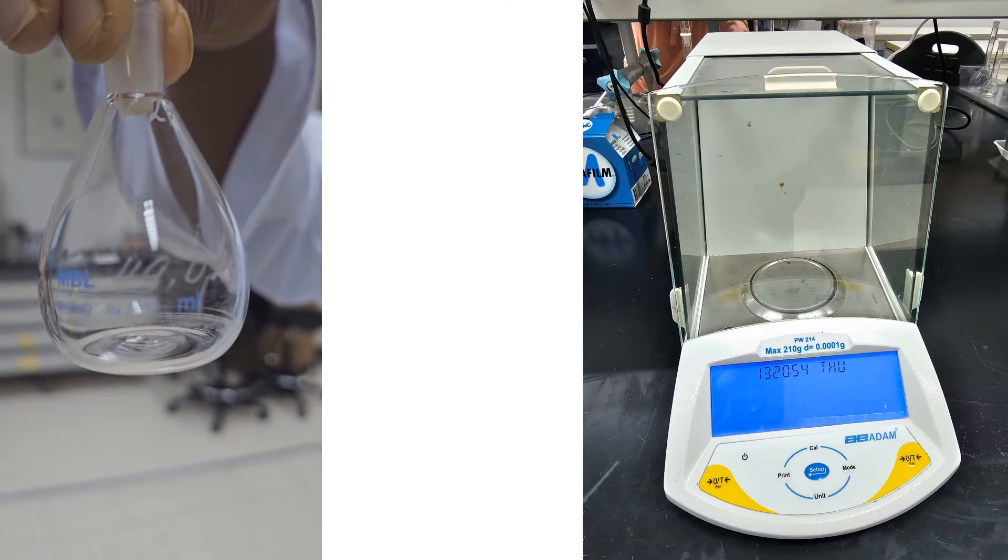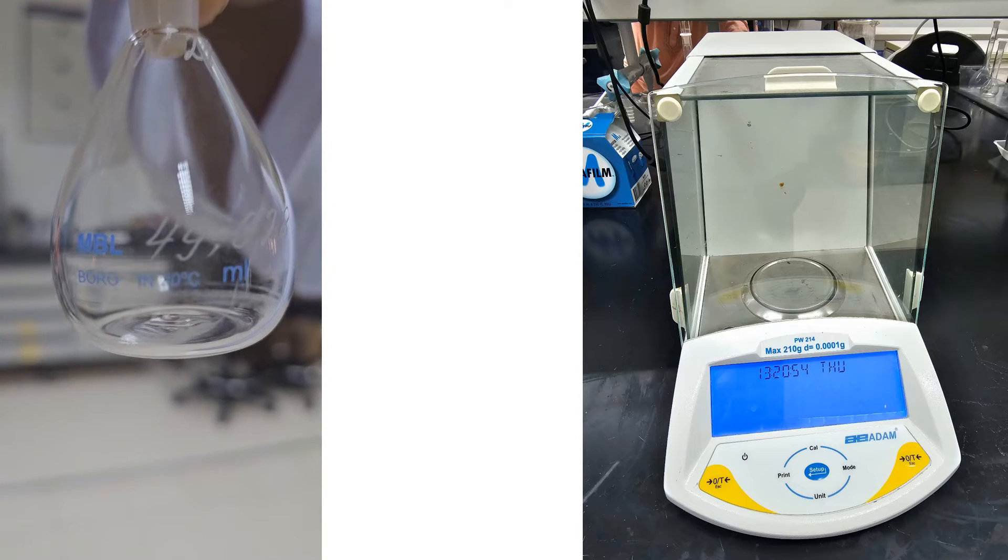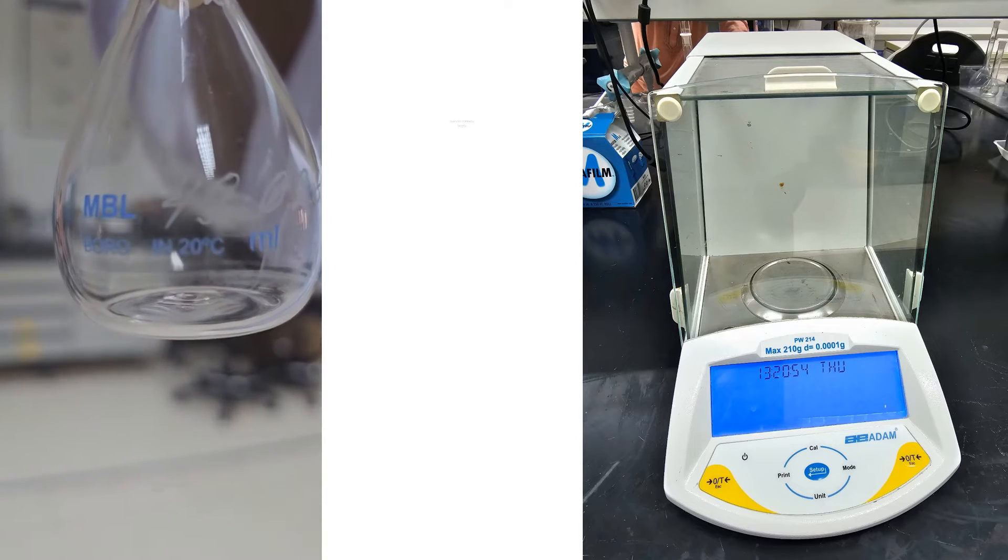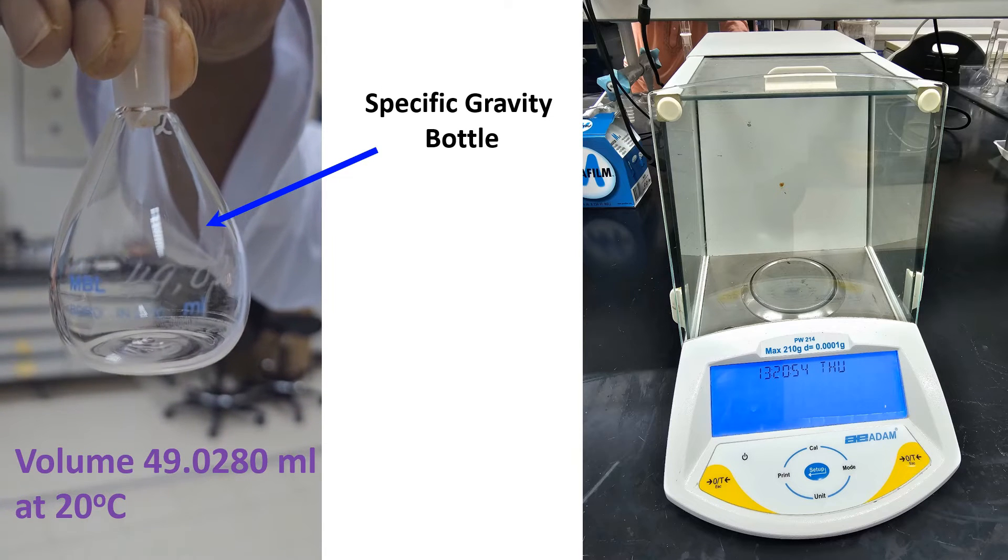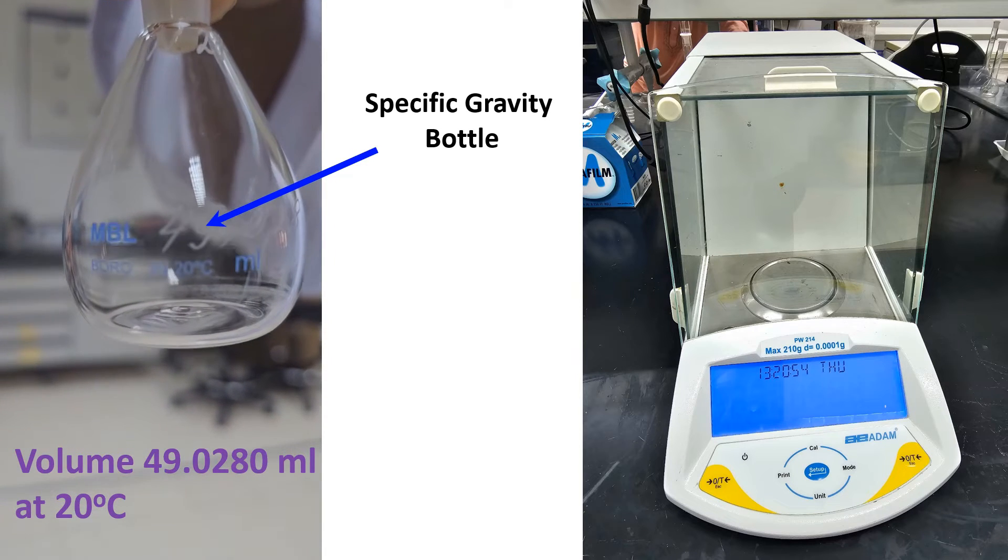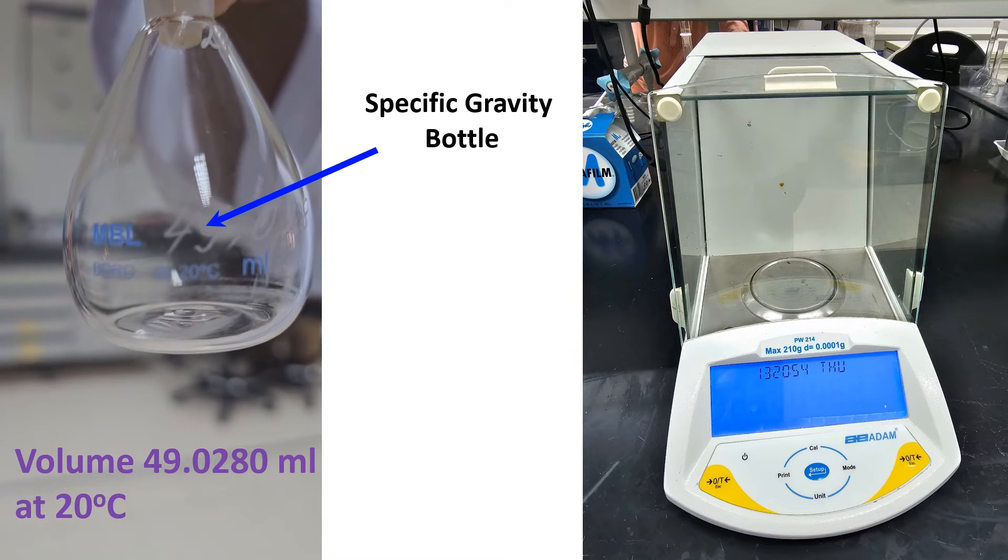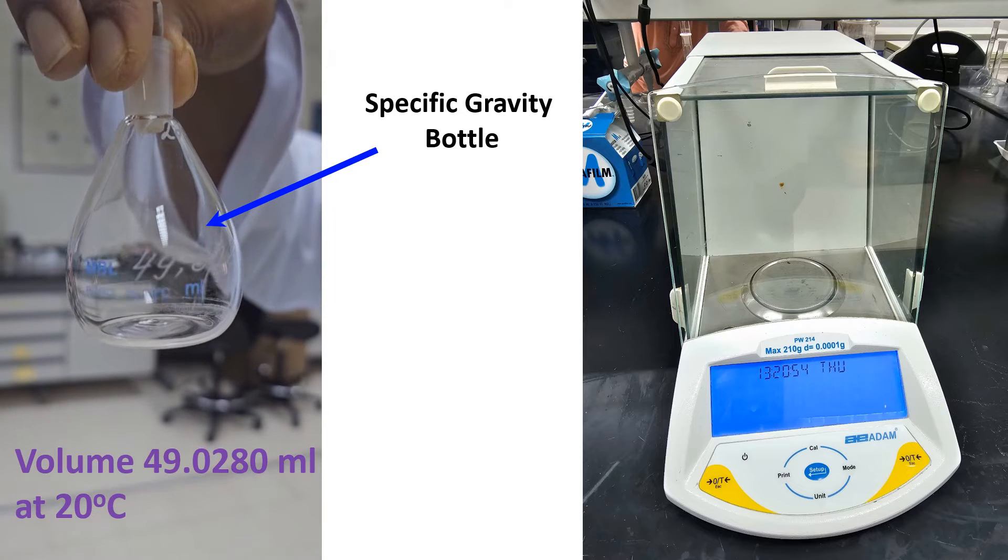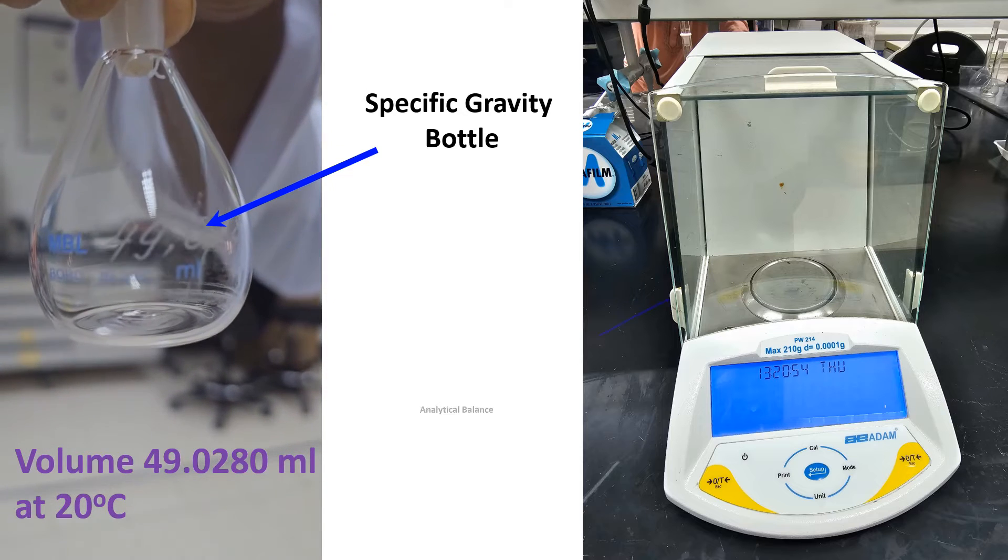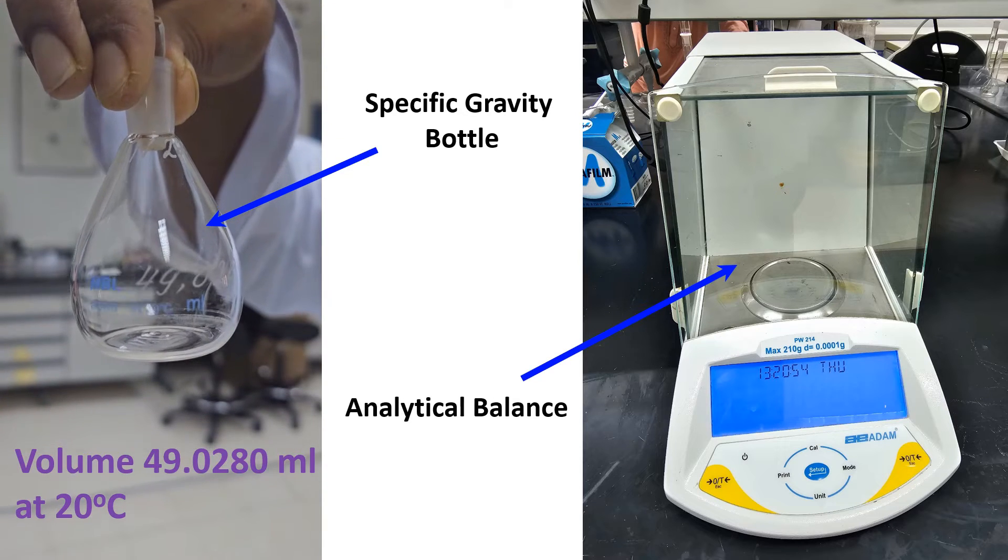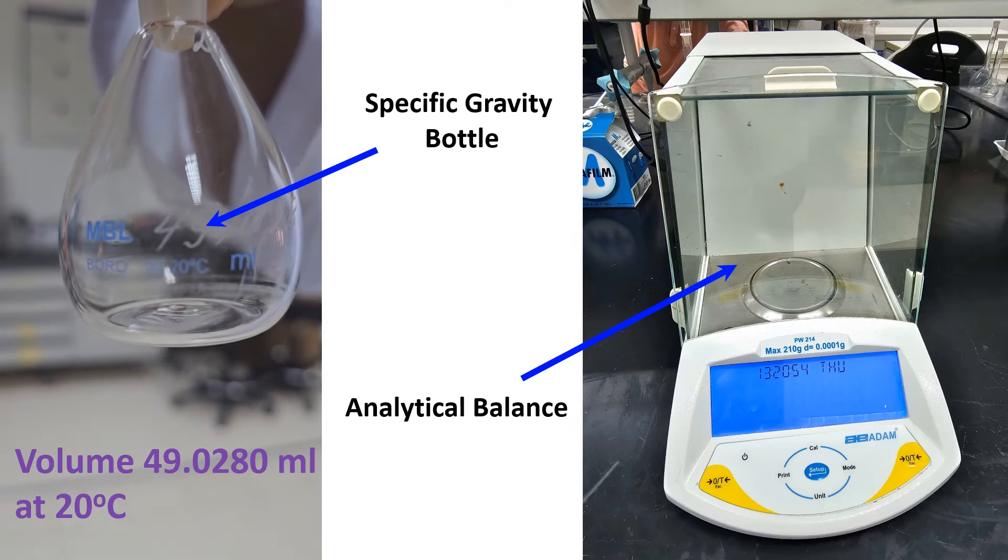We have taken a 50 ml specific gravity bottle. The exact volume written on the bottle is 49.0280 ml at 20 degrees Celsius. We need an analytical balance for density measurement.